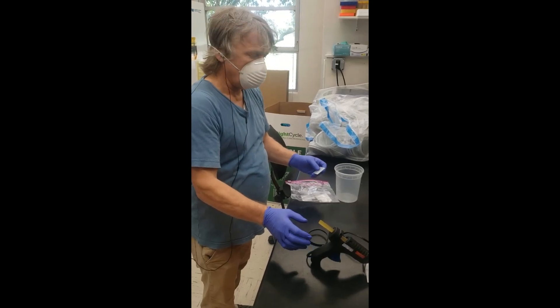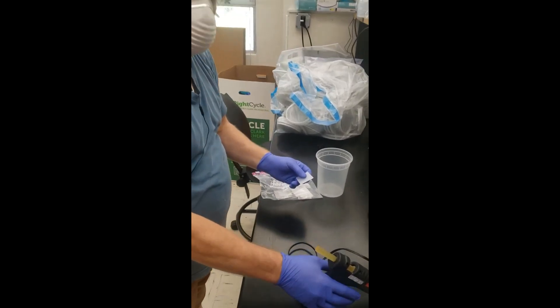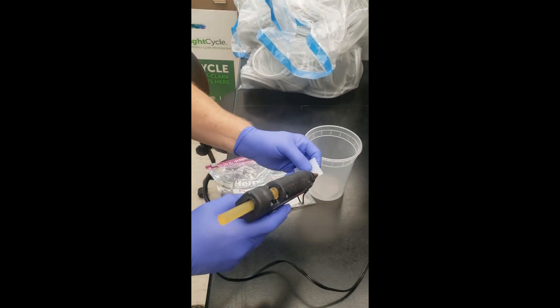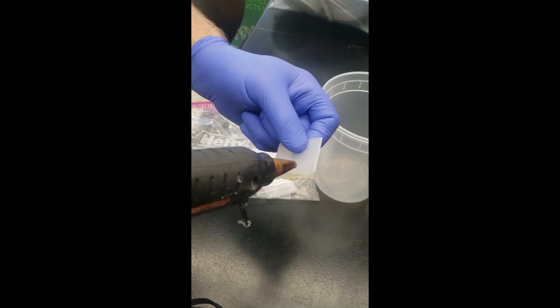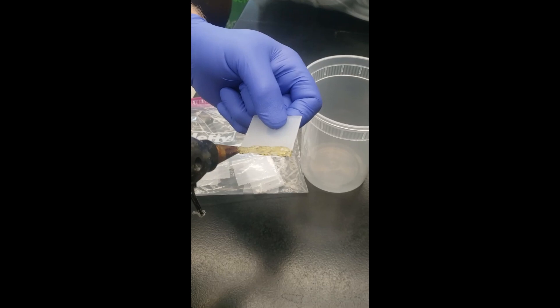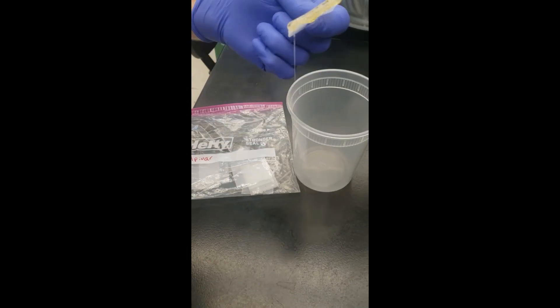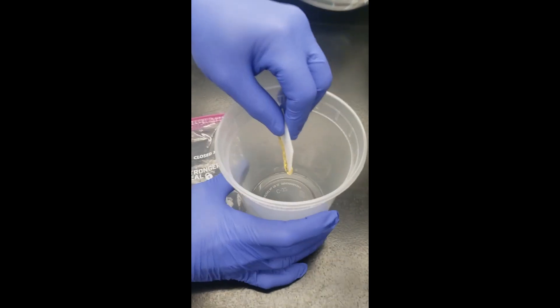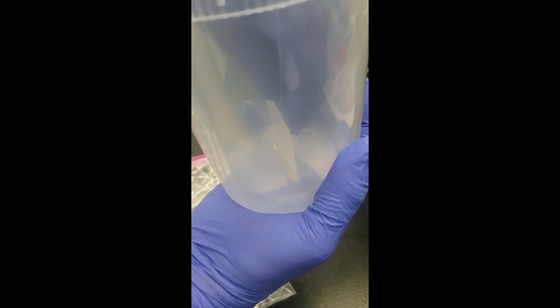First thing you're going to do is prepare the test containers. Dave is going to glue the square to the bottom of the container. Apply glue on the bottom of the square, and while it's still hot, press it right into the bottom of the container. You've got to hold it there for a few seconds until the glue starts to set up. Make sure it stands up.